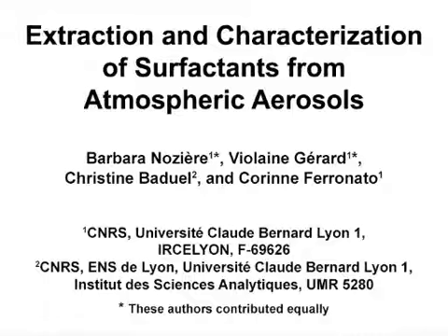The overall goal of this procedure is to extract all the surfactants from environmental samples, such as atmospheric aerosols, and determine their concentrations and surface tension curves. This method can answer key questions about surfactant concentration and surface tension behavior in all the relevant fields. The advantage of this technique, in particular the extraction step, is that it isolates surfactant from complex matrices for characterization.